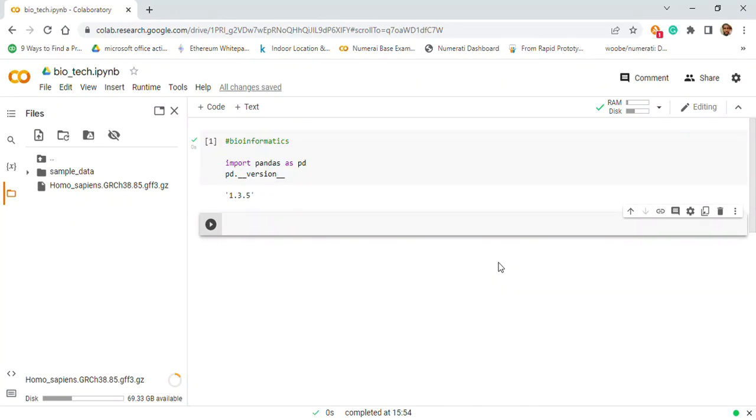In this case now, one of the biological data we are going to make use of, among the many biological data we have, is the genomics data. It is the most widely analyzed data, the genomes, which is what we already have now. So we are going to have access to it.